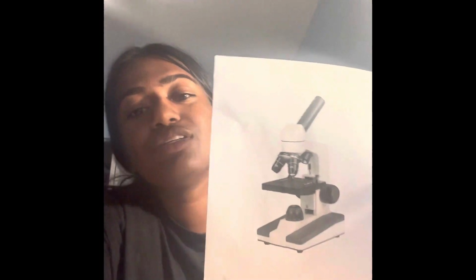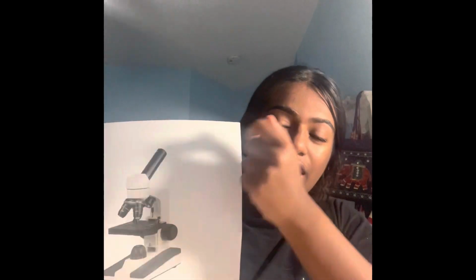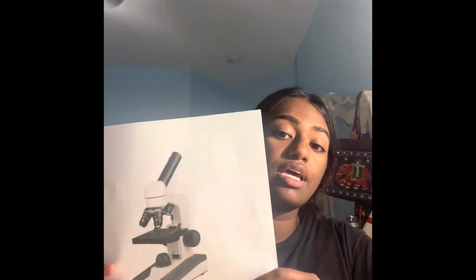So right here I have an image of a microscope. And to start off, if you see right here, this is the ocular lens. This is what you see through to see the image. So you put your eyes right here and you just look at the image down here. And so the ocular lens is actually magnified already 10x. So that means it is magnified 10 times.